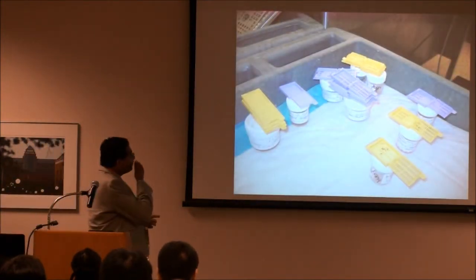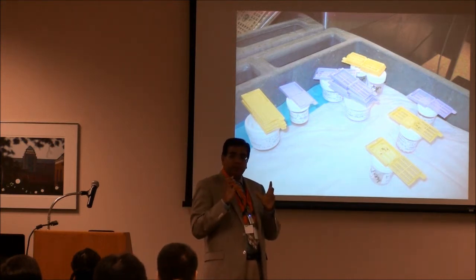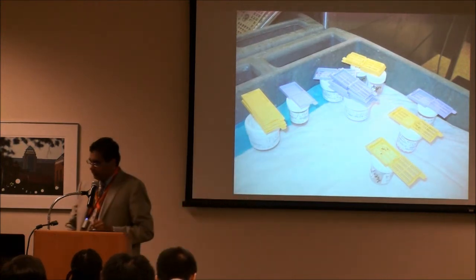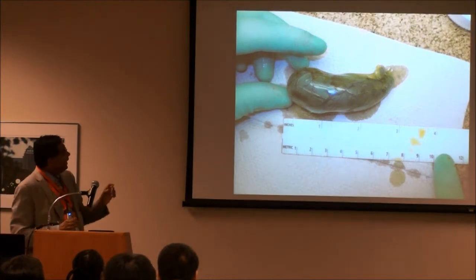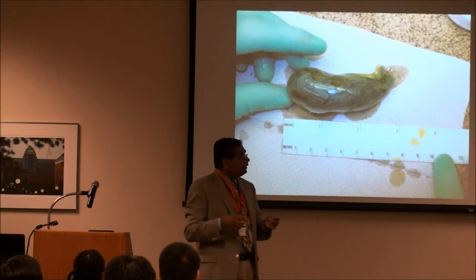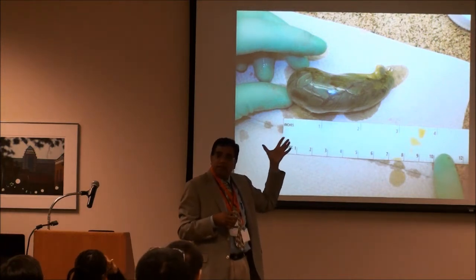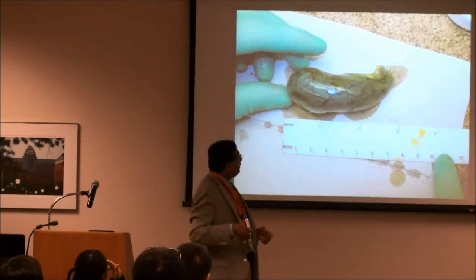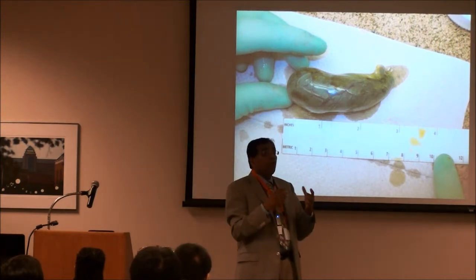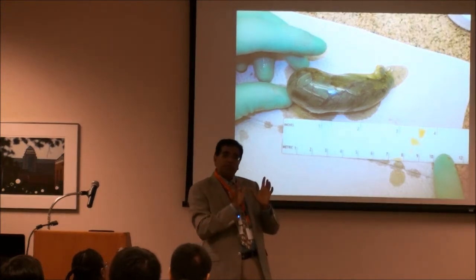What happens is that the specimens get sent to the lab in little bottles like that. They get sent, and then we open up the bottles to get the specimen out. As you can see, there's an example of a gallbladder. Somebody who has gallbladder pain, they take the gallbladder out and send it to us, to make sure there's nothing wrong with it, or to determine what is wrong with it. I'm giving you one specific example here.